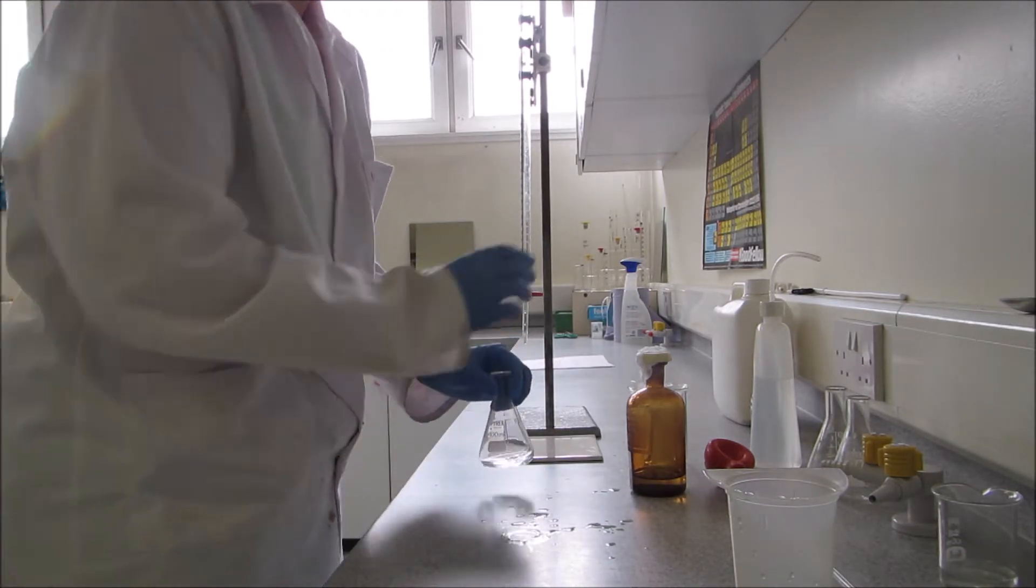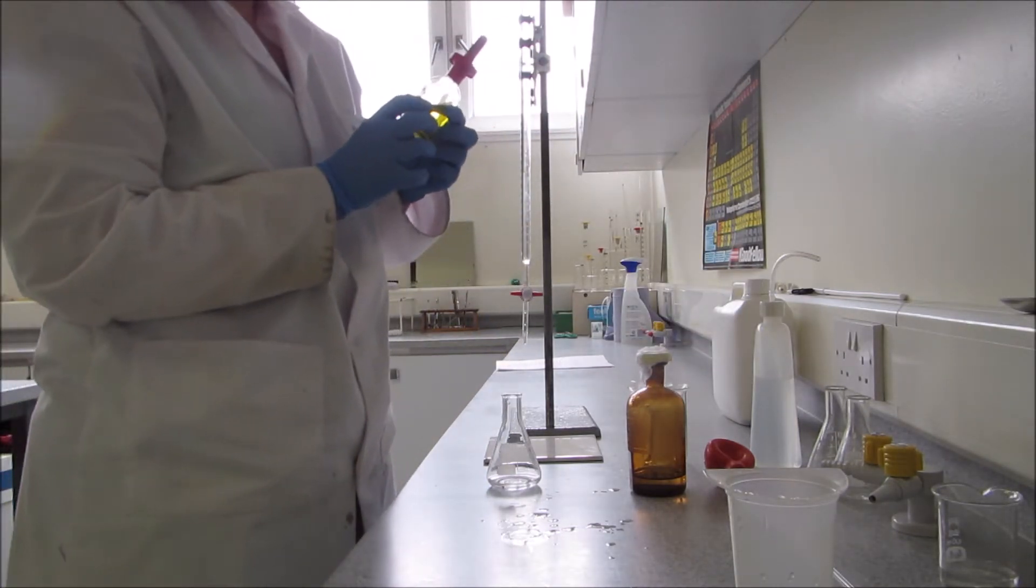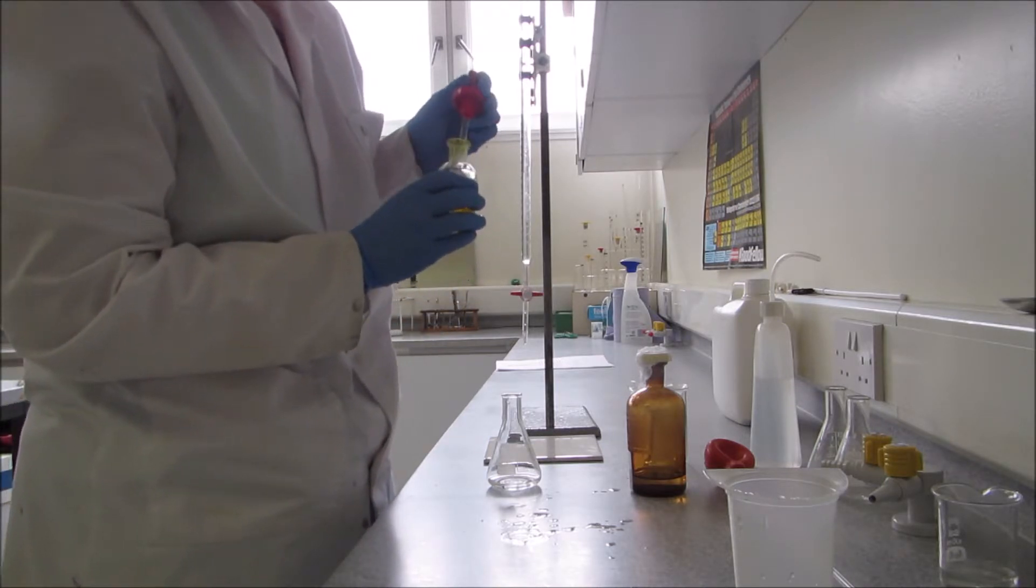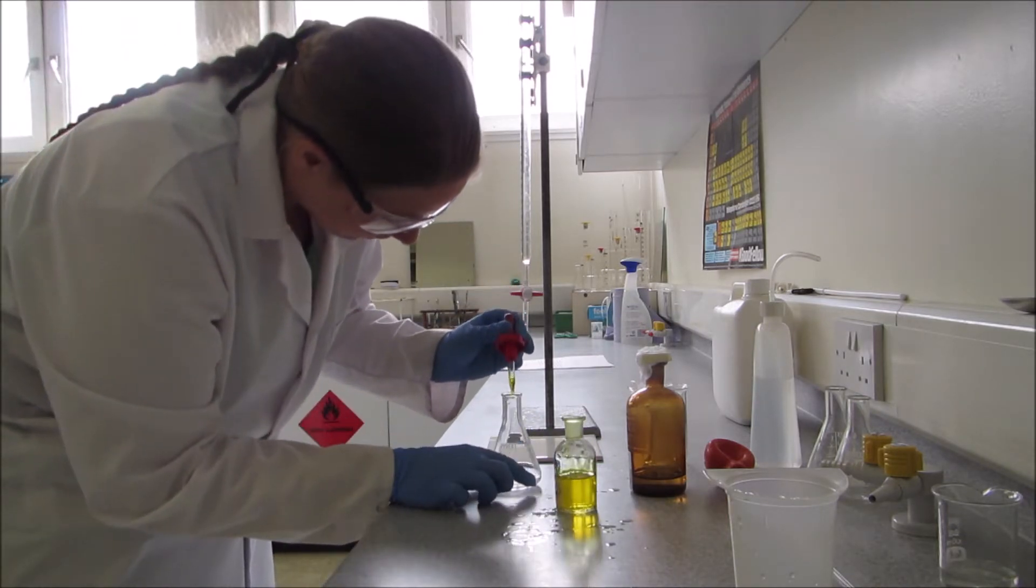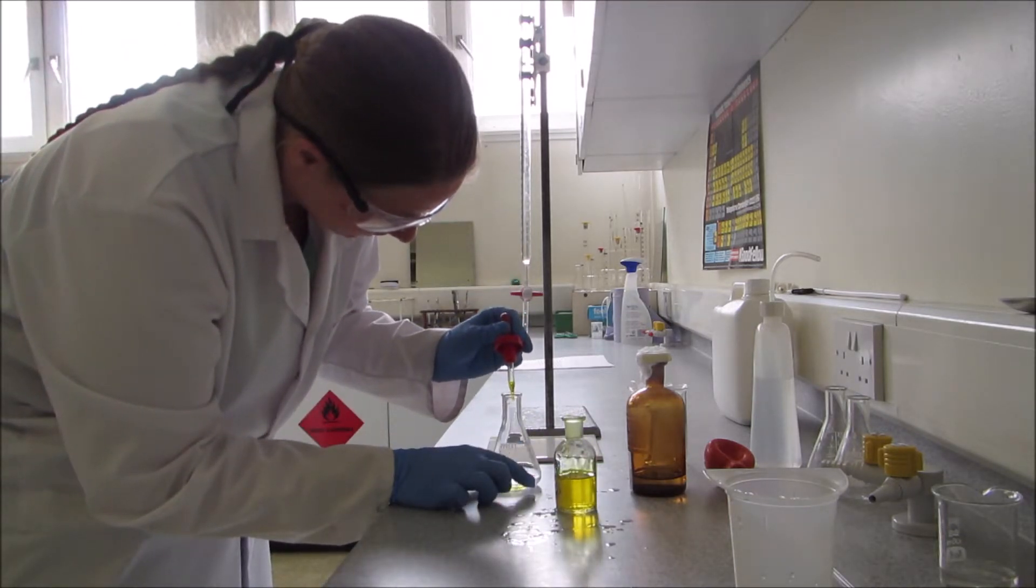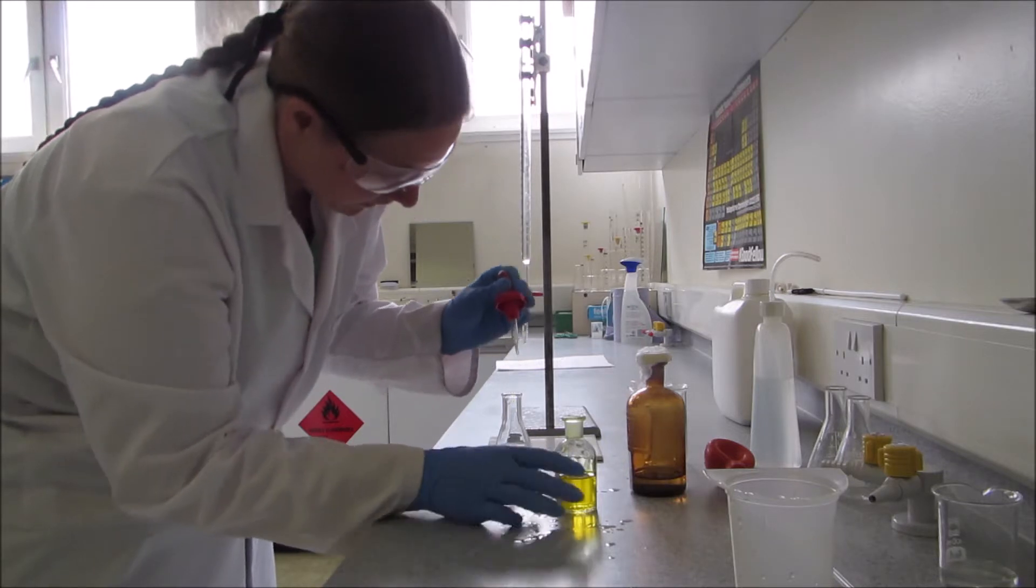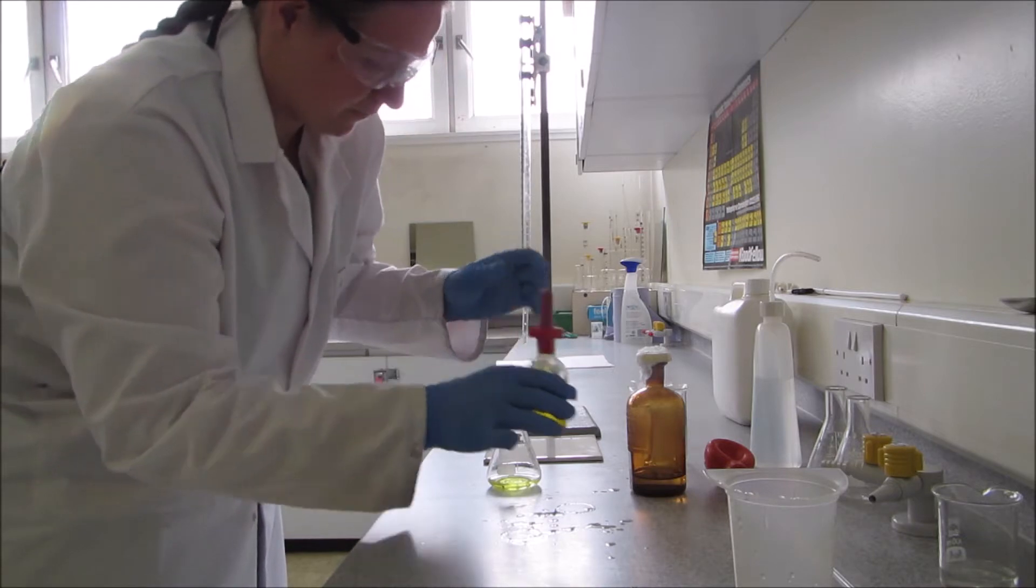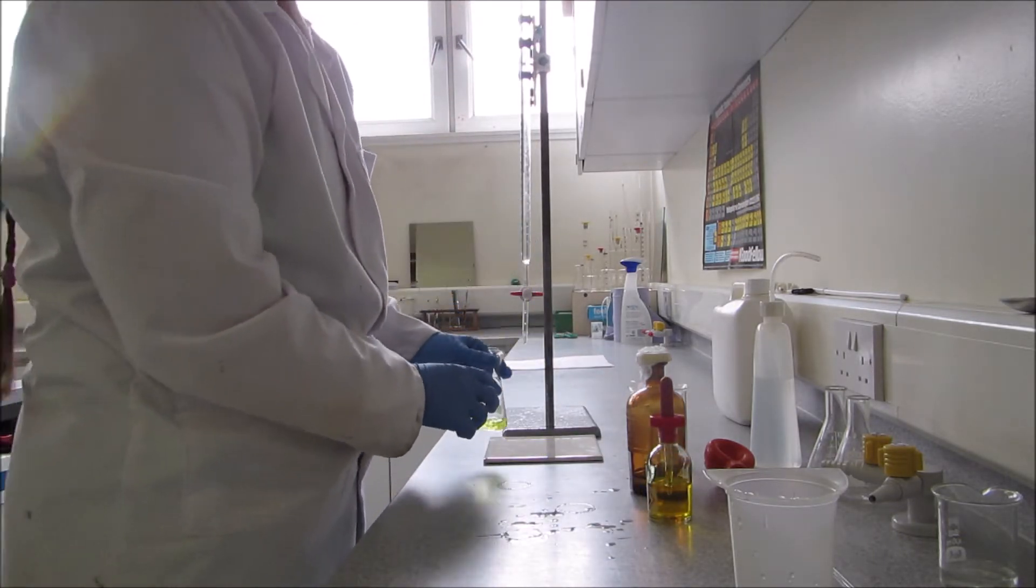Before I start the titration, you then have to add your indicator. For this experiment, potassium chromate indicator is used. It's also an irritant, so again, just be careful that you don't spill it. I'm going to add 10 drops. Give it a bit of a swirl to mix it, and you can see it's a yellow color to start with.